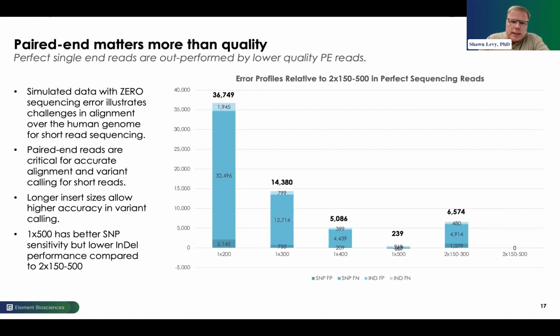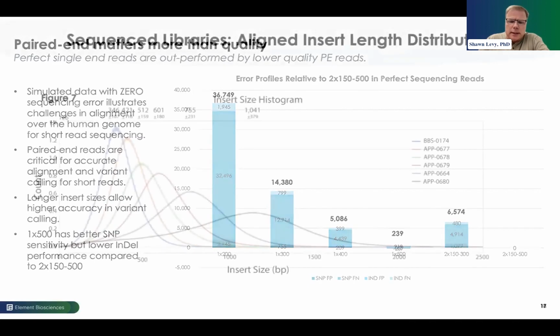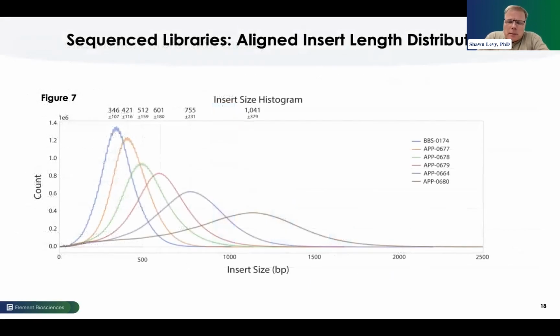So insert size matters, and paired end sequencing capabilities absolutely matter as you look at more and more complexity in terms of experiments. Matt highlighted this in terms of the alignment-based insert size of where we have data. The key additional feature I wanted to mention is, again, to emphasize these are alignment-based insert sizes. They are not fragment-based insert sizes, say from a TapeStation or a Bioanalyzer.